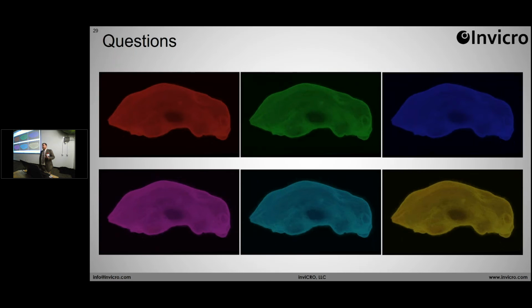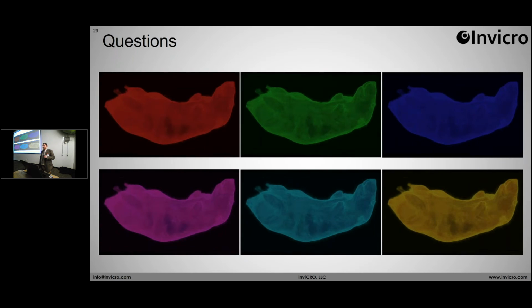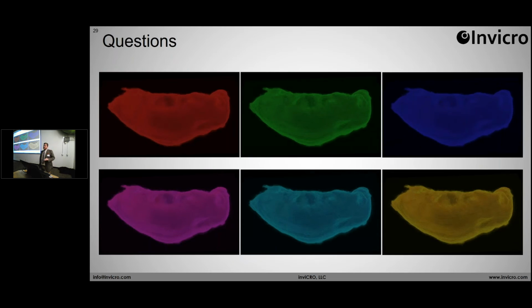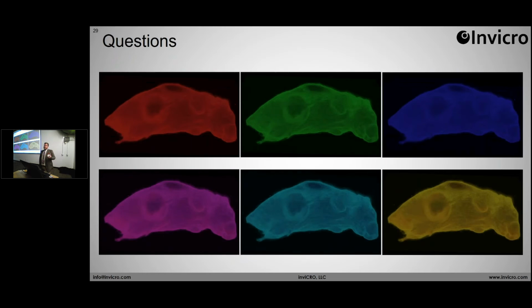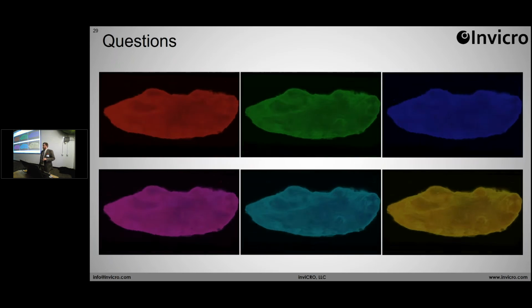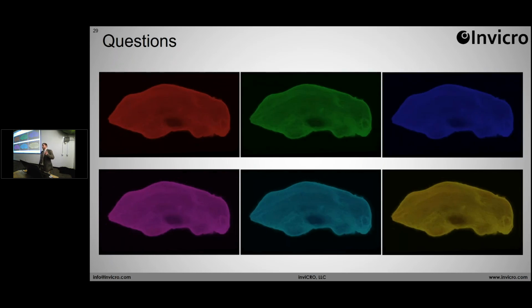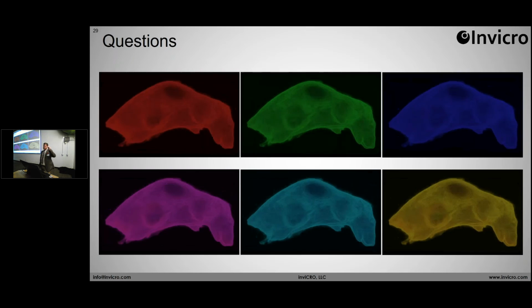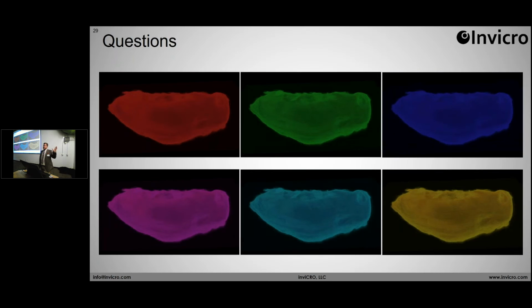In that case, it depends on what the desired workflow is. We can slice through an entire sample at 5 micron, or if we're slicing through at, say, 25 micron, and we want a 5 micron slice, we can cut a 5 micron slice and then a 20 micron slice, and then just pick up where we left off.